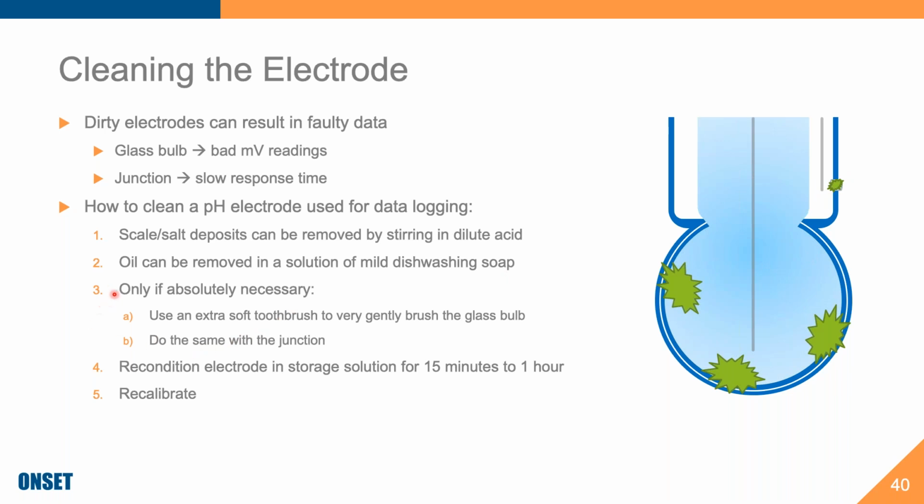No matter what, after you've done this, you must condition. And my recommendation, after cleaning it, you should always recondition an electrode. If you've cleaned it with just some acid, then you can recondition it for like 5 or 10 minutes just in storage solution, just to get that hydrated gel layer, a happier hydrated gel layer back. And that's this layer again.